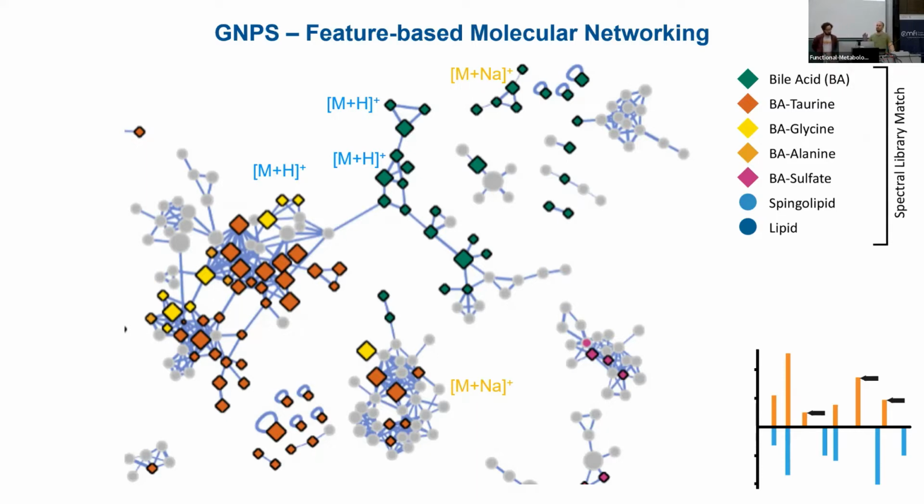So for now, what we look at today is only based on MS2. There is another step of establishing connectivity between the nodes, based on the peak profiles. That's a tool Robin and I developed called ion identity molecular networking, that does a feature correlation analysis between basically co-eluting compounds, and if they have a very good matching shape, and if the mass delta fits some user defined values, you will also establish additional connectivity.